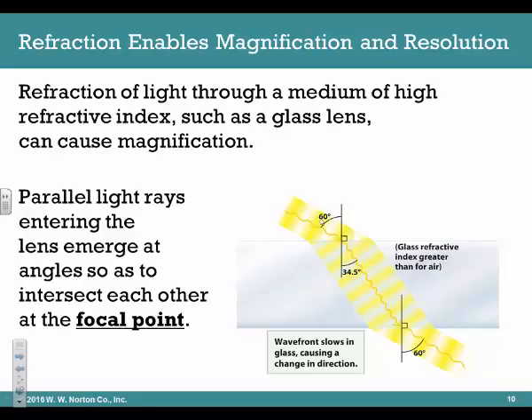when it goes through different materials of different refractive indexes. So in order to minimize that bending, because we don't want the light to bend so much that it no longer goes through the objective lens, because then it wouldn't get to our eye, and it basically ends up making the image seem fuzzy when we look at it.